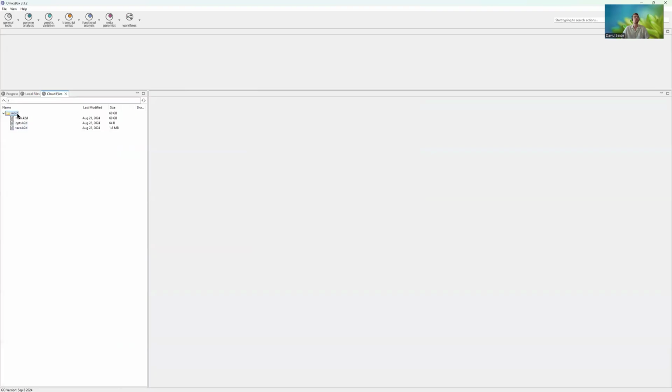You can upload data to your personal cloud file space in OmicsBox. So you can drag and drop data here. I created a folder with the name WOL2, which refers to Web of Life. They provide data for taxonomic classification, and I was playing around with their database to see if it fits.